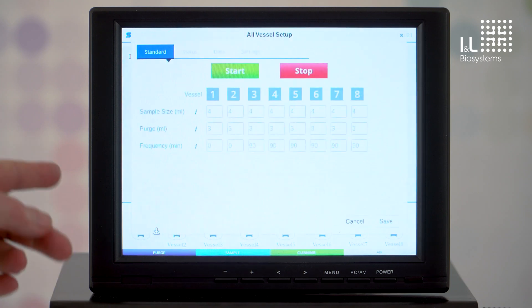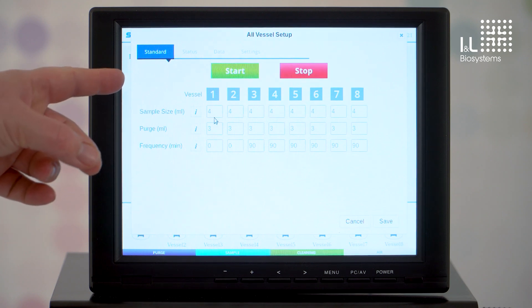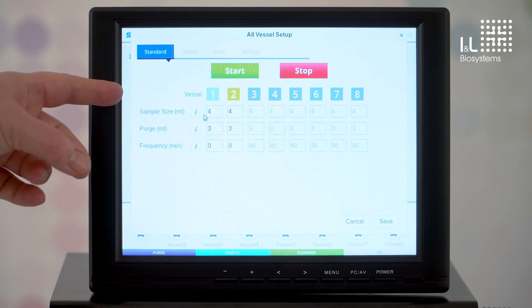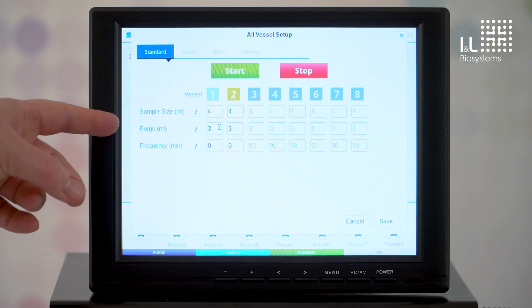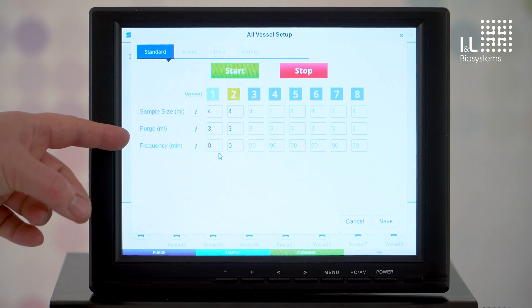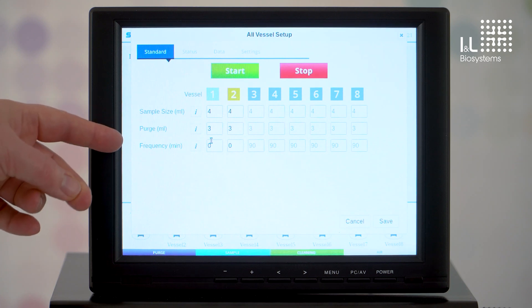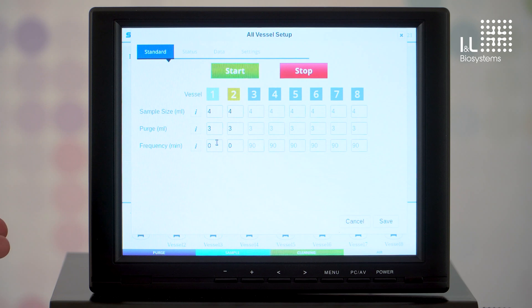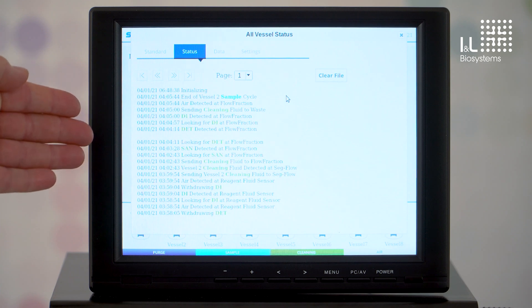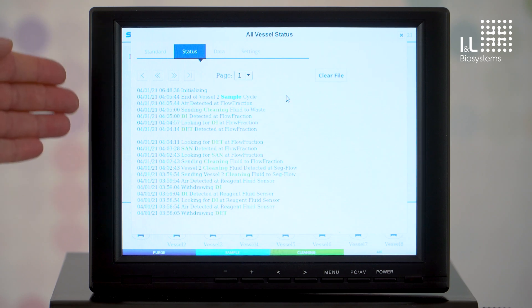I will now present a few more functions of the software. Here you can determine which vessels are to be sampled — for example, vessel one and vessel two. You can enter how much of the sample you want filled, how large the fore-run should be, and you can set the frequency at which the sample should be taken — for example, every three hours or always consecutively one after another. The timestamps in the status menu present you in chronological order exactly which steps the system is currently performing and has completed.